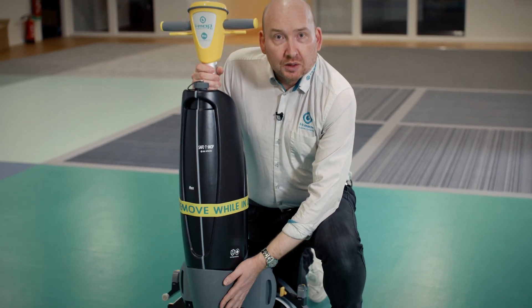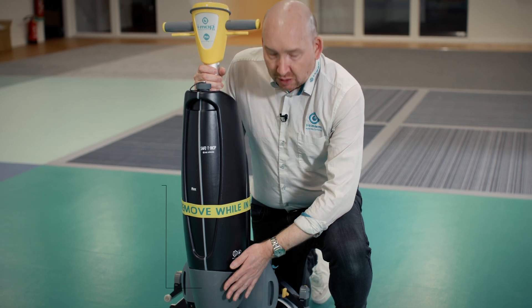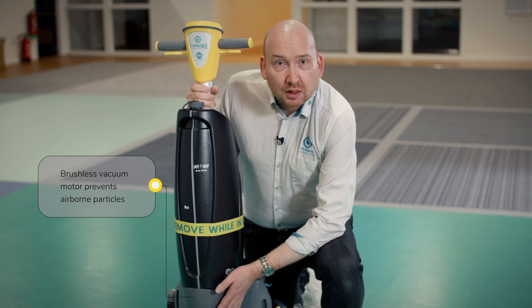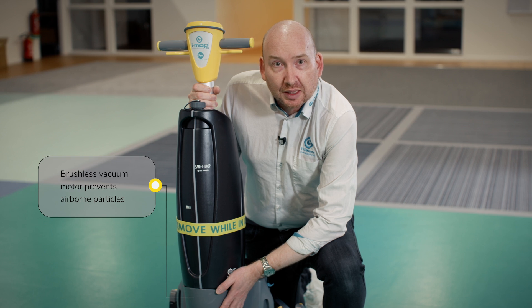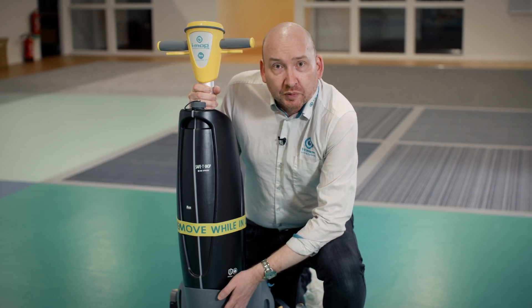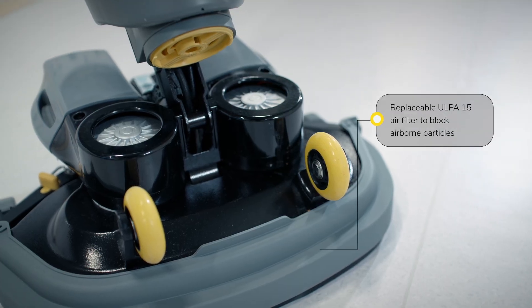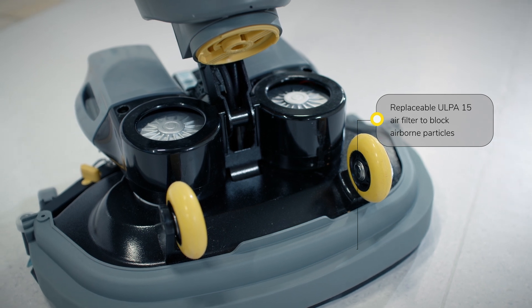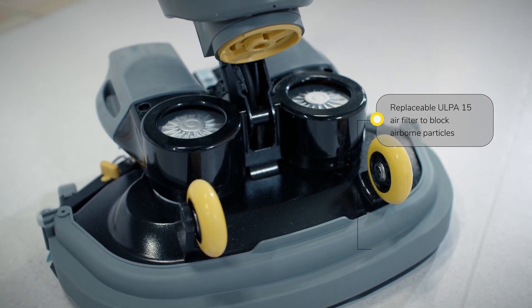Continuing down, this is where the vacuum motor is stored. We use a brushless vacuum motor so that there's no contact inside the motor, which would create particles in the air. It's a completely contactless brushless motor. On top of that, there's a removable filter underneath the air out for the motor, which is an ULPA 15 filtration system, removable for any time that you use the machine.